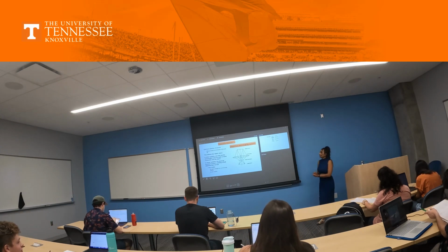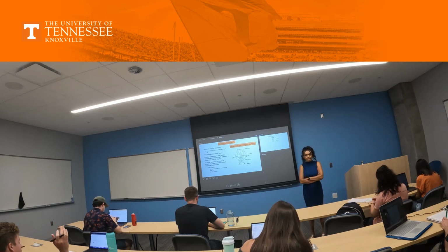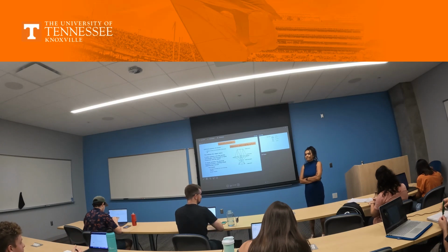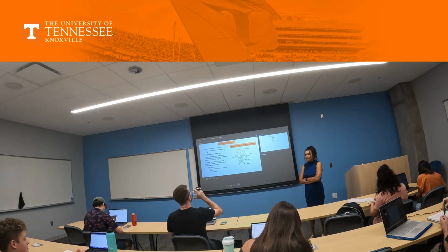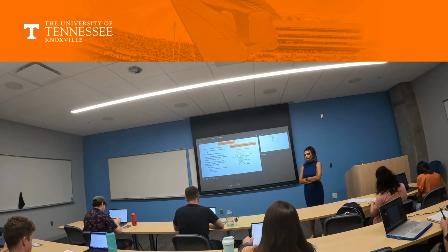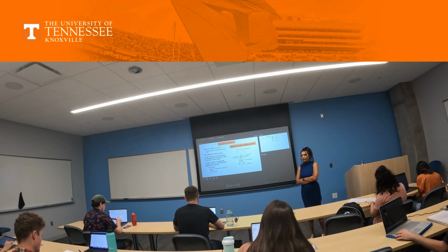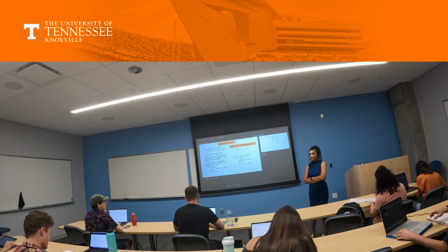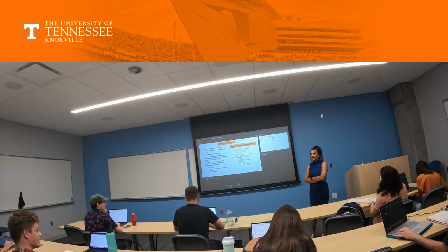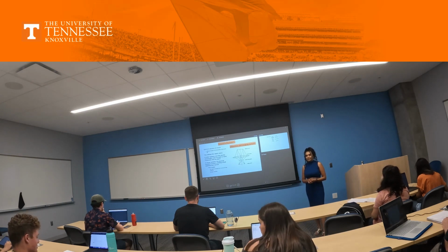What do we do in the condenser? Isn't it how you illuminate, so to speak, the actual specimen with electrons? And then there are 3 different things you can do with it primarily. Parallel beam, which is called the Kohler method. And then you can focus it for diffraction, EDS, EELS, and do translation and tilting.